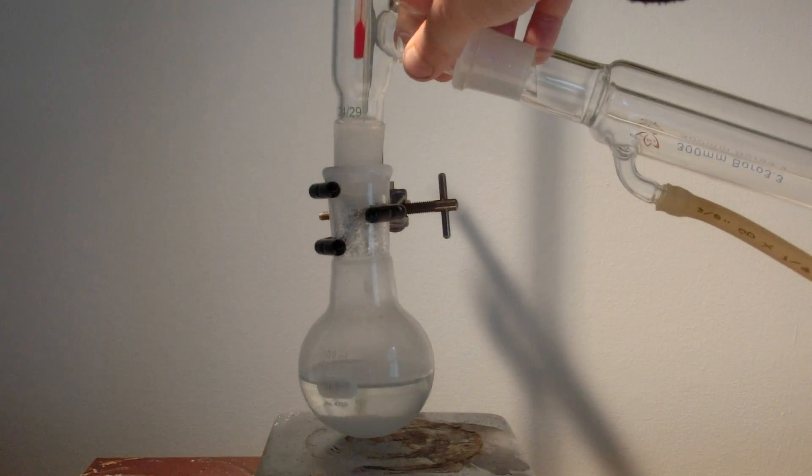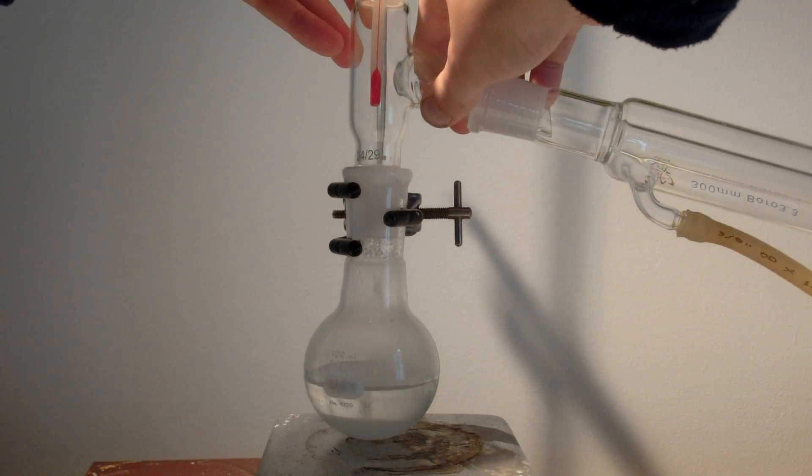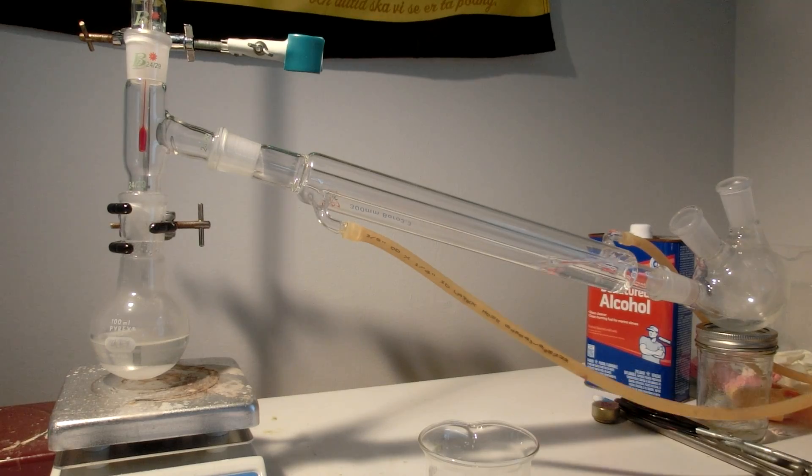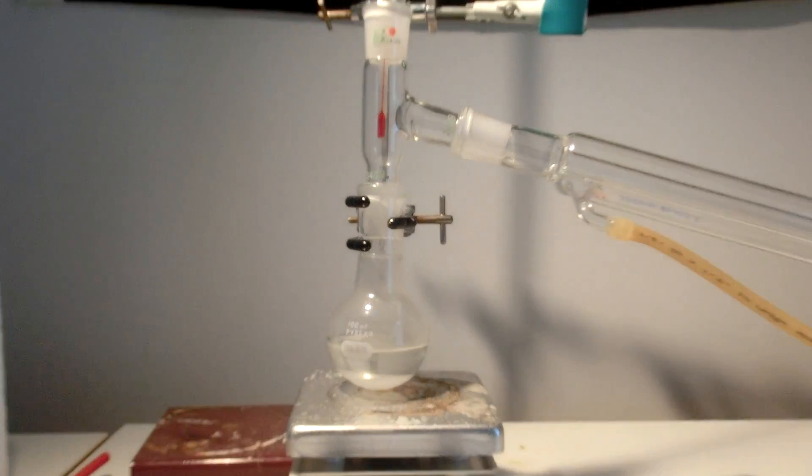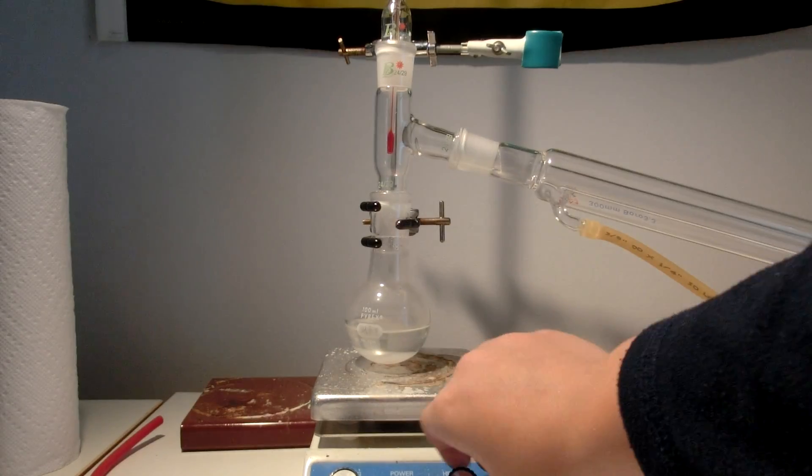The round bottom flask should then be attached to a distillation apparatus. The pump for your condenser should then be started. Next, turn your hot plate onto high heat.